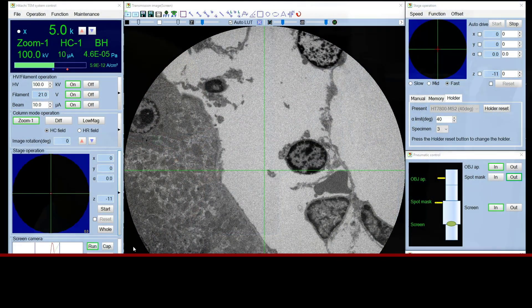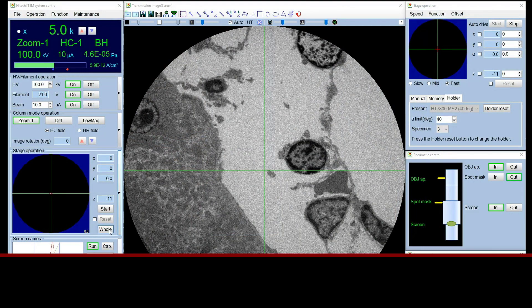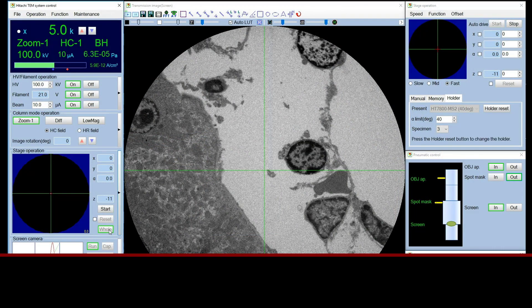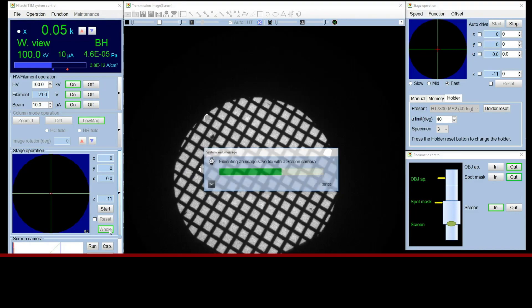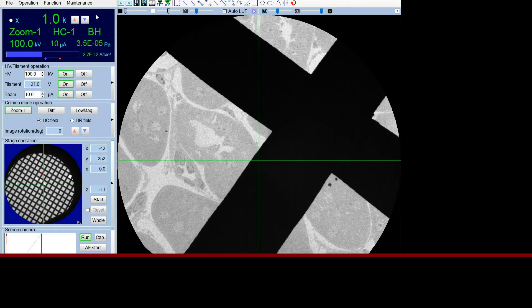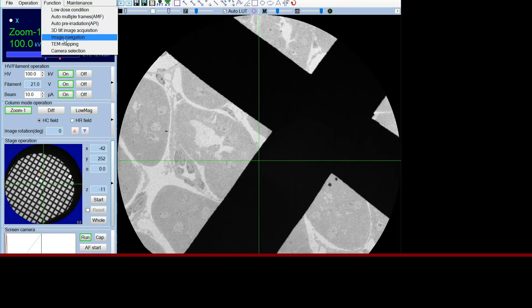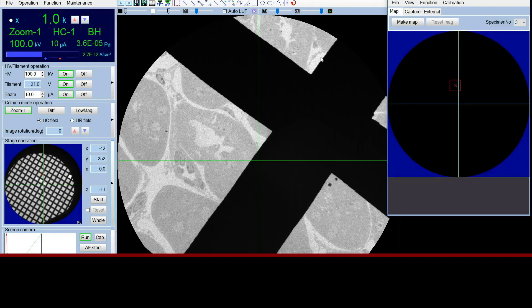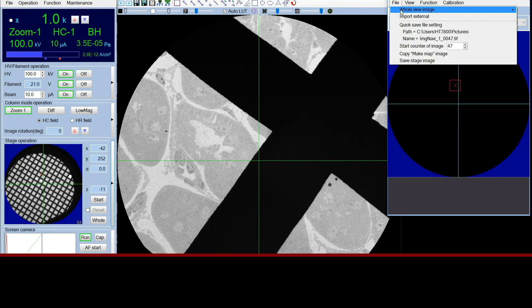The utilization of a robust, high-speed CMOS camera in place of the traditional viewing chamber makes navigation and beam manipulation more intuitive. Given this digital technology is more sensitive than the naked eye, it allows for lower-dose conditions and damage-less sample screening.